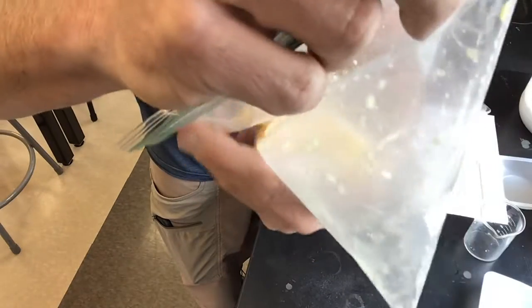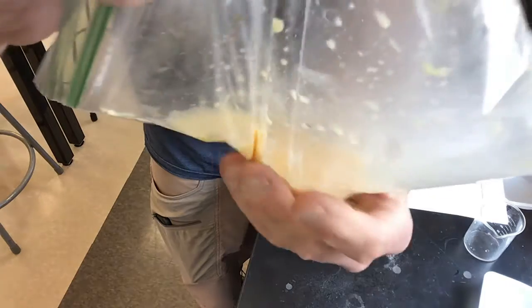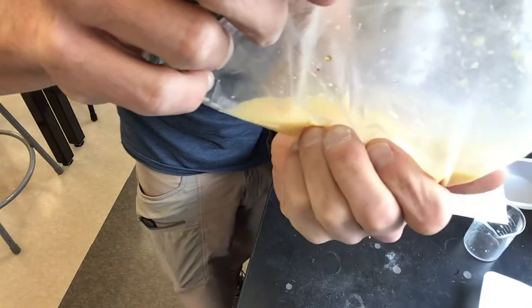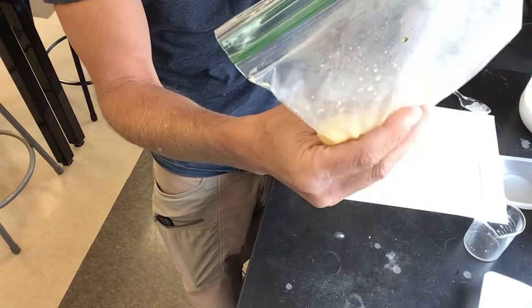And you can't tell, but this is very warm. So the reaction caused the temperature to increase. Make sure you get all those observations down in research question number 2.